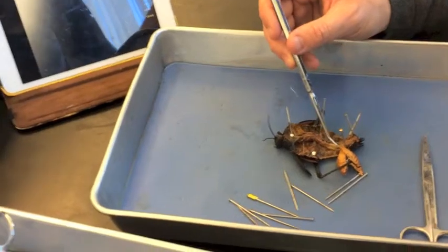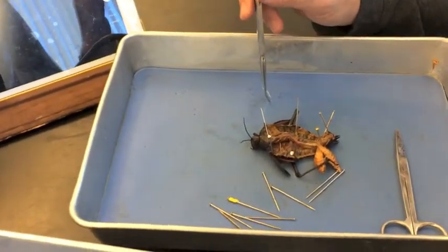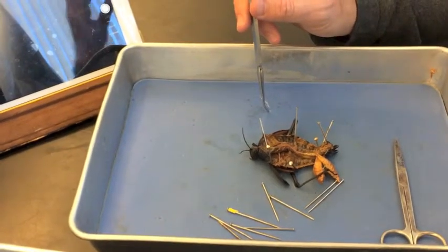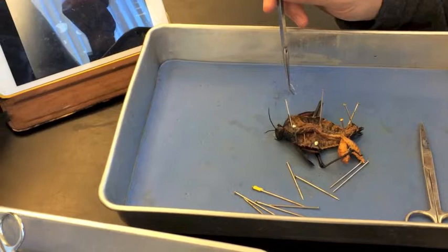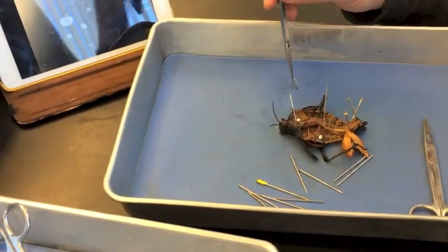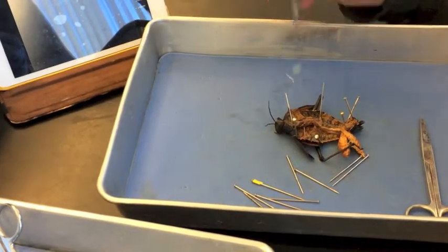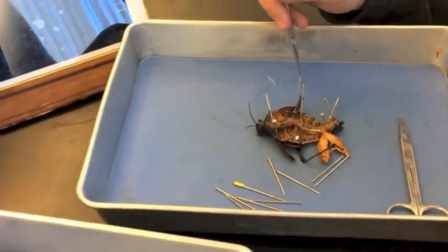Right, these tubes are called Malpighian tubules, and everything has to pass through them, and they absorb the water out of the waste before it's excreted as like a dry pellet. And that way they retain all their moisture, and they can live in a terrestrial environment. That's basically it. These are the eggs. It's a pregnant female. Sound good?